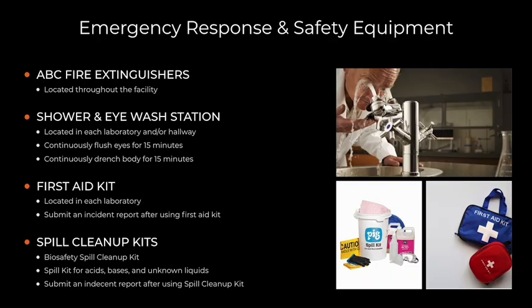First aid kits are located in each laboratory. It's important to submit an incident report after using the first aid kit. Spill cleanup kits such as Biosafety Spill Cleanup Kit and Spill Kit for acids, bases, and unknown liquids are also available throughout the facility. It's important to submit an incident report after using the Spill Cleanup Kit.